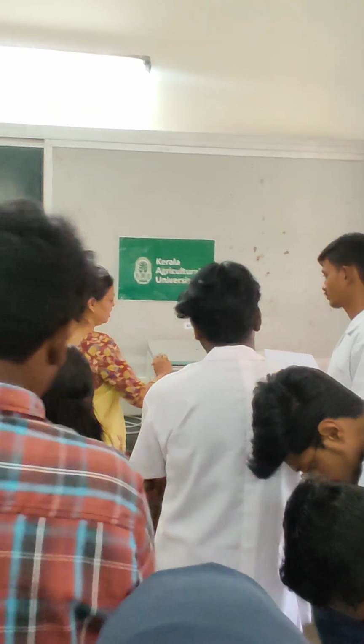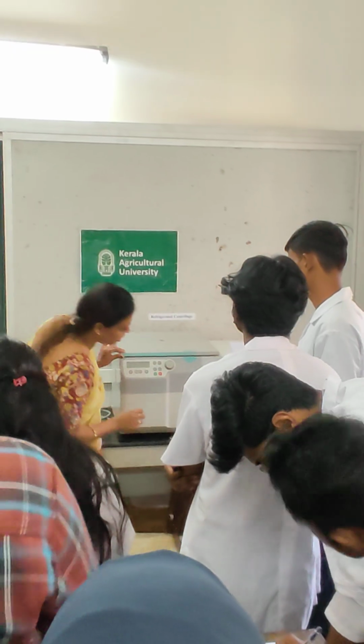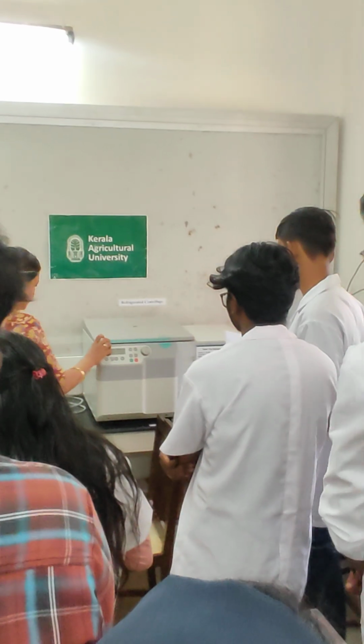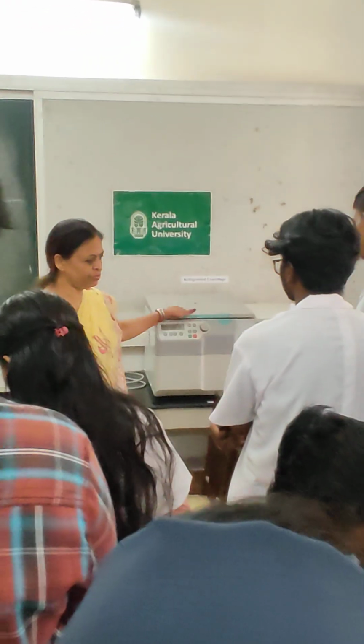That one is a centrifuge. You know the purpose of a centrifuge: you want to separate the particles. You take the sample, keep it in the centrifuge and you can see it. This is not for our concern, this is for biological studies. This is a refrigerated centrifuge. That means you take the sample and centrifuge it. The light particles will settle at the top and the heavy ones will settle at the bottom. That is the principle.